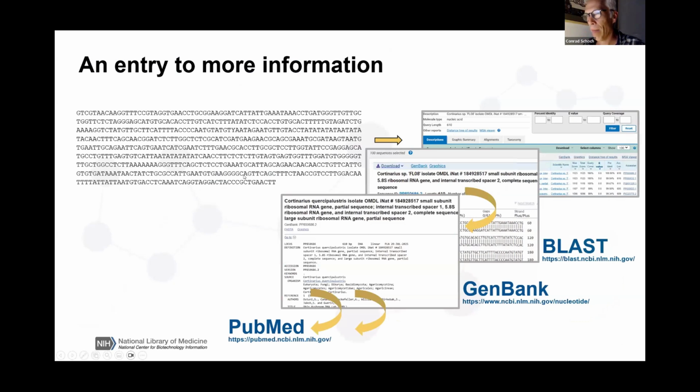So here we have our sequence. I think some of you will be familiar with BLAST, maybe most of you. That's probably the one interface that a lot of people use at the NCBI. So the obvious thing to do would be to go to BLAST with your mystery sequence in hand. And then from BLAST, you can see what other sequences it's closest to and learn something from them.